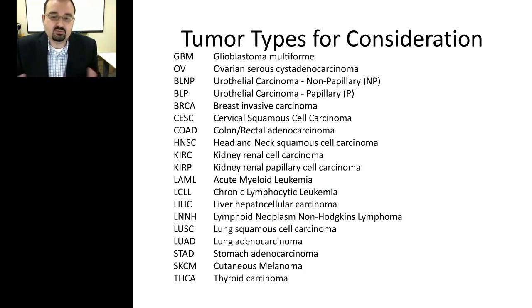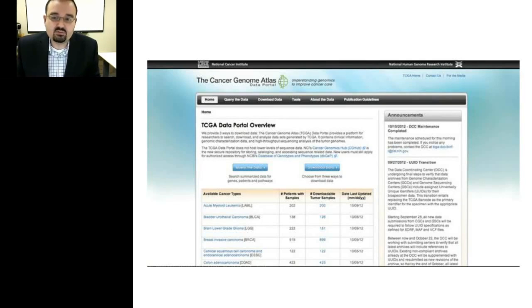Principal components analysis, for those who are not familiar, is basically a 3D representation of gene expression on a global level, such that samples that are more alike in their gene expression are balled together, and samples that are more different are separated. Here we can see a wide separation between the tumor and normal samples. It's not uncommon to see dysregulation of expression of thousands of protein-coding genes in the transformation of normal cells to tumors.